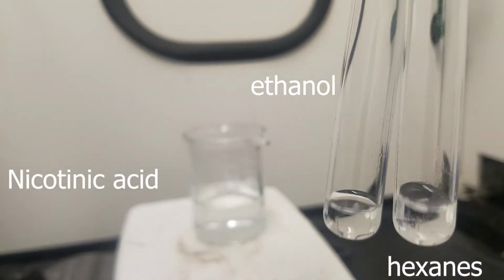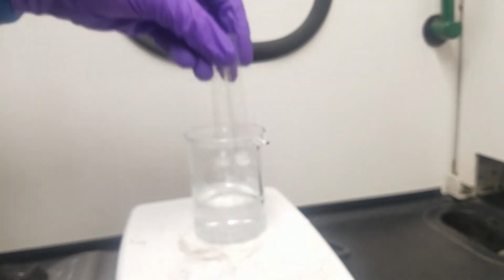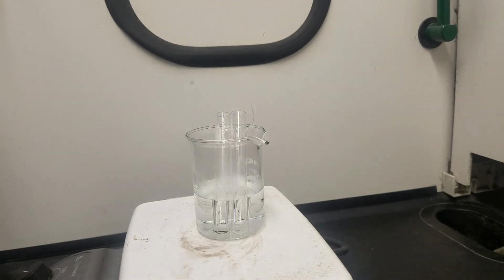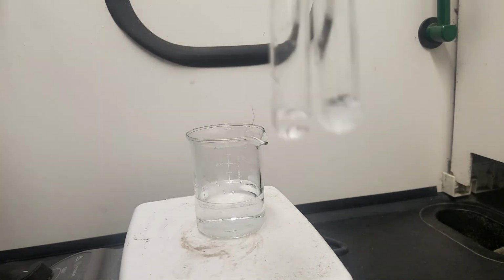So now what we're doing is moving into the next one. Nicotinic acid, we've got our ethanol and hexanes, and you can see that kind of white powder when I kick it up. If you didn't catch it already, it might not be a bad idea to click pause on some of those just to make sure you get a legitimate observation, or an easier observation, I guess I should say. Same deal, sped up time, a little bit of heat, see if we see any changes.